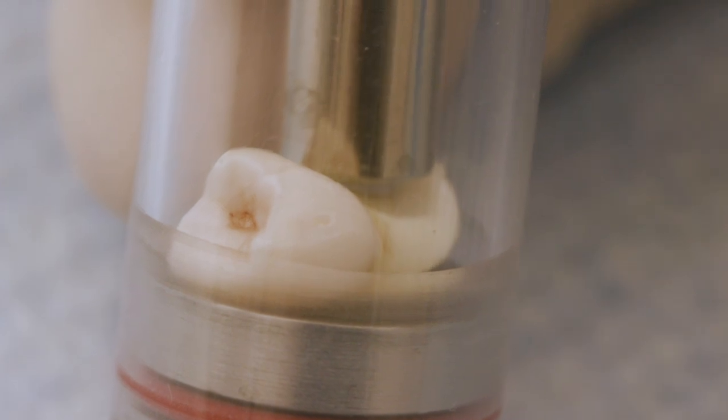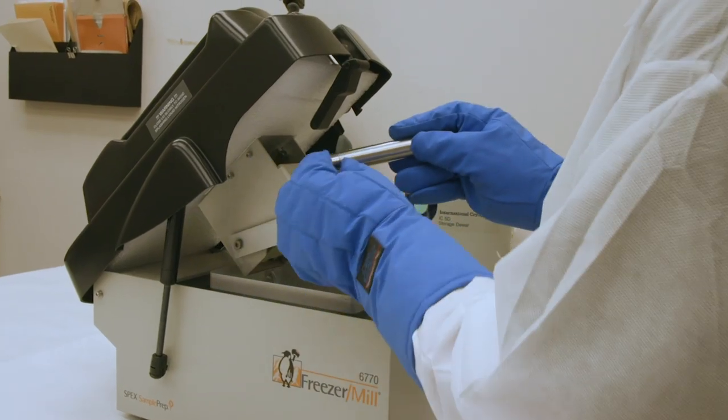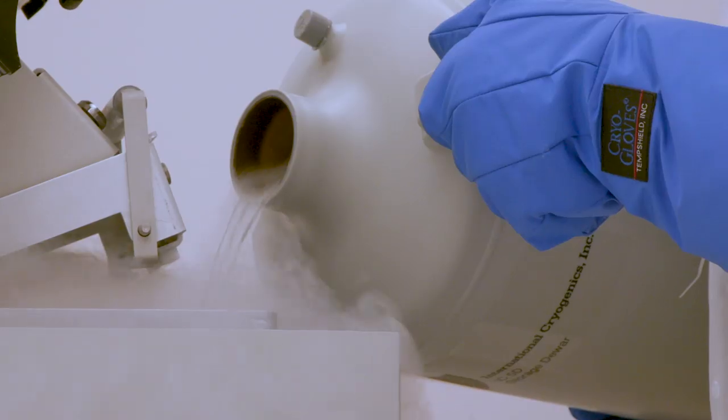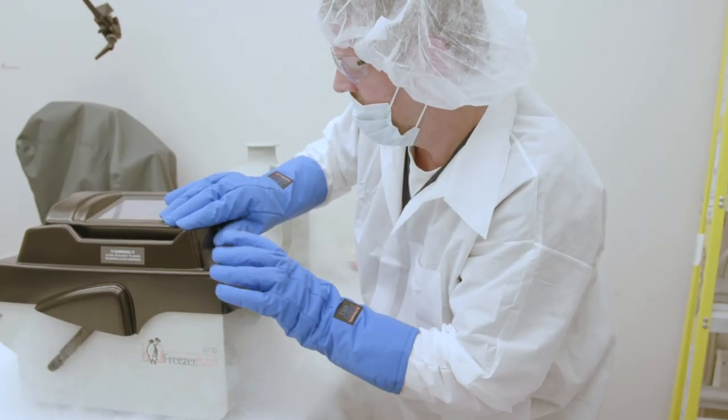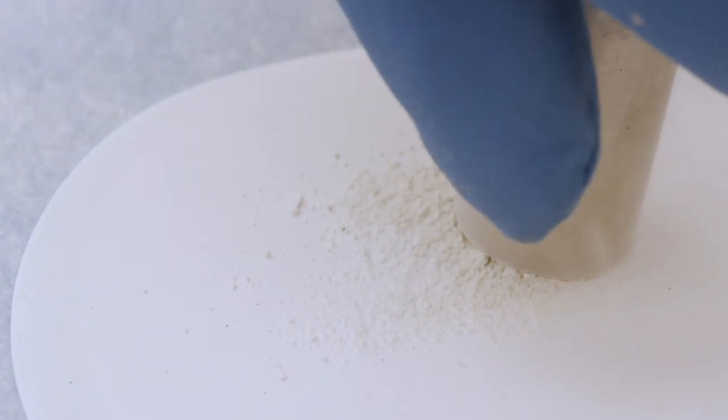Sometimes skeletal and dental fragments are all that remain to investigators. The calcium lab at the center can extract DNA from ground-up teeth to zero in on the owner's identity.